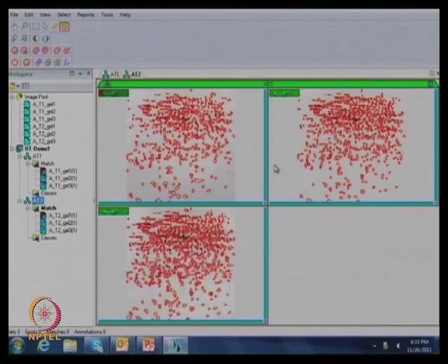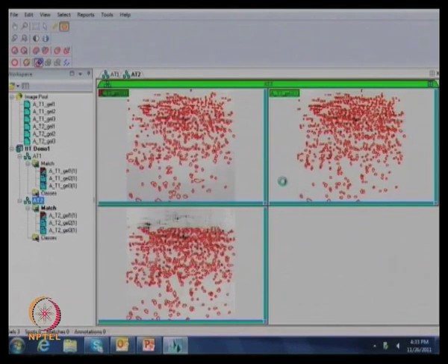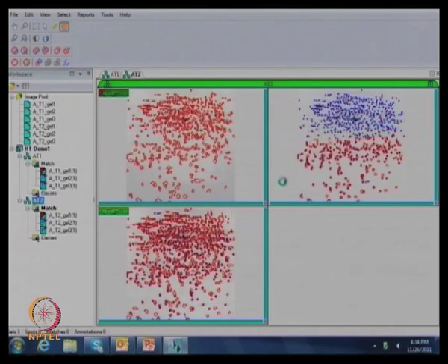Now it's completely finished. The same way, you can go through each individual gel by zooming and 3D view, and select which are spots and which are not spots. Then you can directly match them. Now I'm doing the same matching. 1274 matches have been done. So these gels are more reproducible as compared to our control set. See, there are no vectors even without giving a landmark. So this is a very fine gel. The replication which we did was confirmed. These replications are okay.